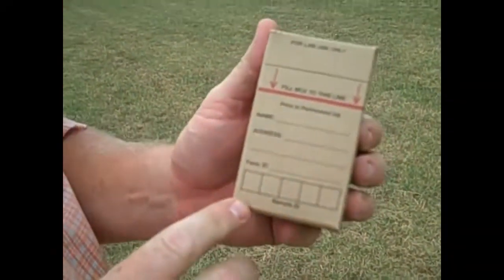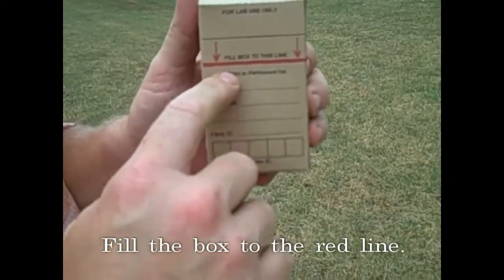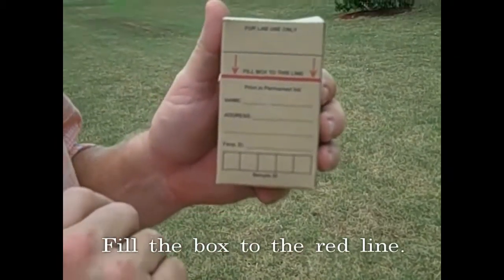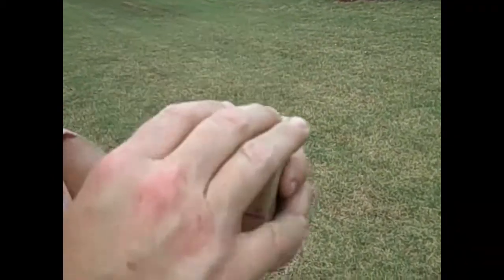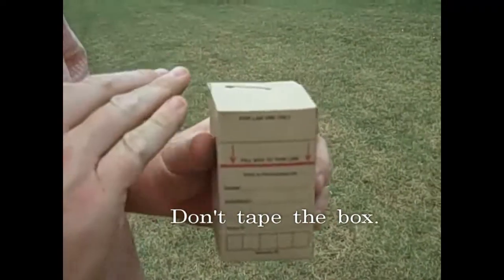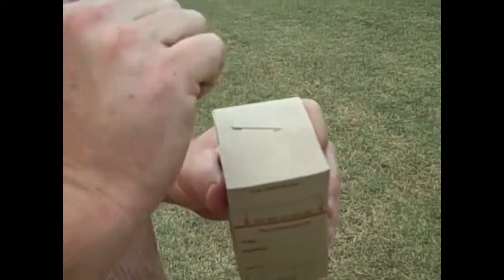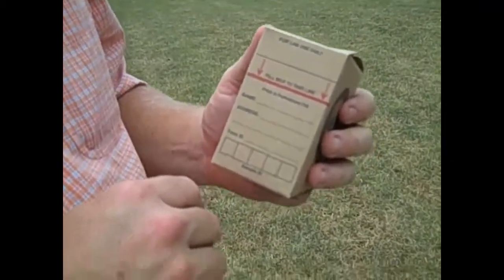A couple of other things to remember when pulling a soil sample: fill it up at least to that mark. We don't need any more than that, but we need at least that much. If you fill it only halfway, we may not have enough to run the sample, and if a mistake is made or something goes wrong and we need to resample, there definitely won't be enough. Also, the folks at the soils lab ask everybody not to tape the top of these boxes. If a little bit of soil spills out, it's generally okay, but please do not tape the top of the boxes because it makes it very hard for them when the samples get to the soils lab.